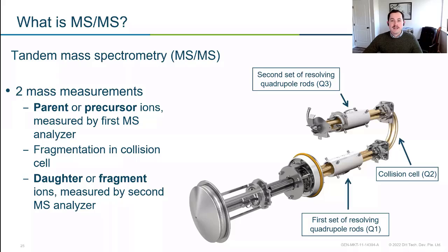So what is an MRM experiment? MRM, multiple reaction monitoring, sometimes people just refer to it as MS-MS. Here we are taking a parent or a precursor, and we're selecting that. We're focusing on that parent or precursor and filtering out everything else. You'll often hear people refer to it as parent and precursor interchangeably. Parent is a little bit of an older term. Typically in literature, you see it referred to as precursor now, but they both mean the same thing.